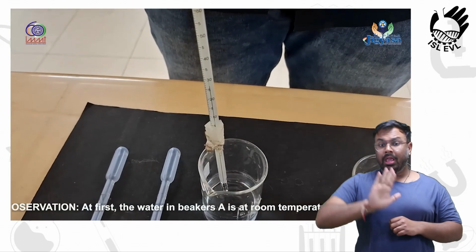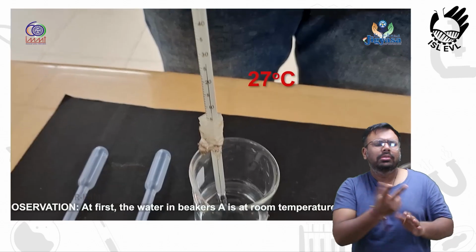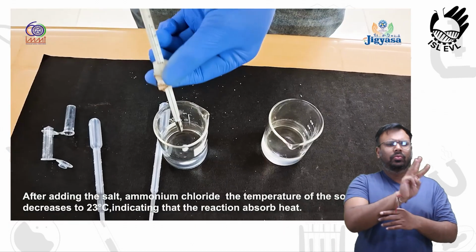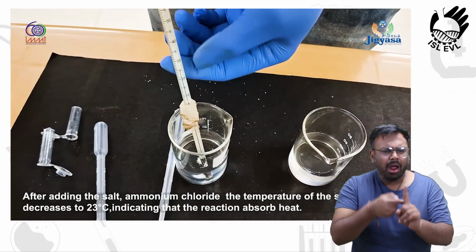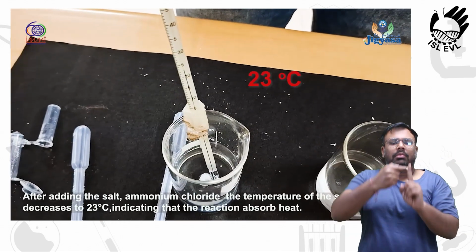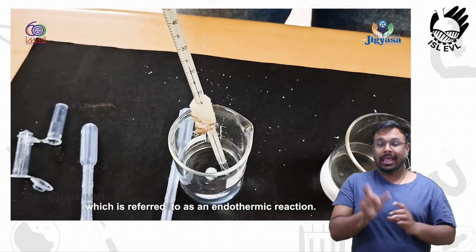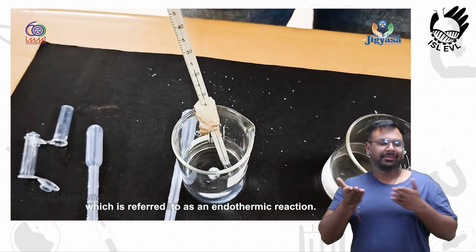Observation: at first, the water in beaker A is at room temperature, which is 27 degrees Celsius. After adding the salt ammonium chloride, the temperature of the solution decreases to 23 degrees Celsius, indicating that the reaction absorbs heat, which is referred to as an endothermic reaction.